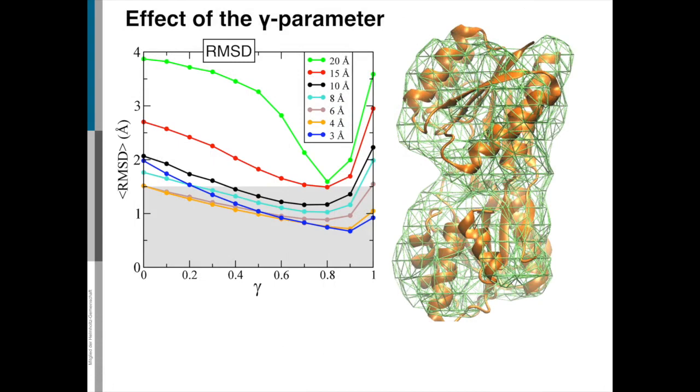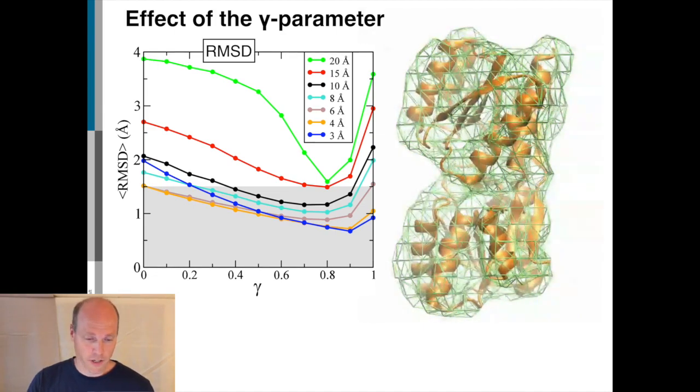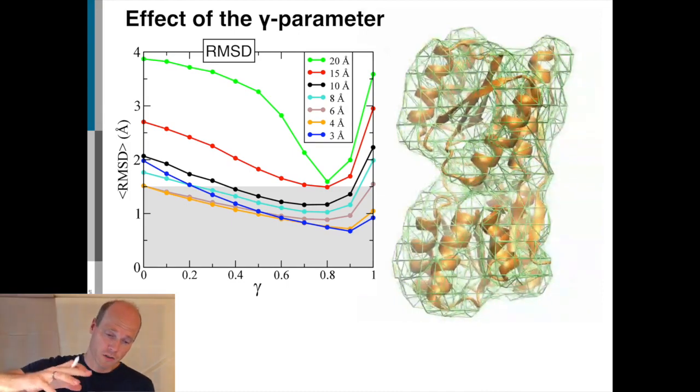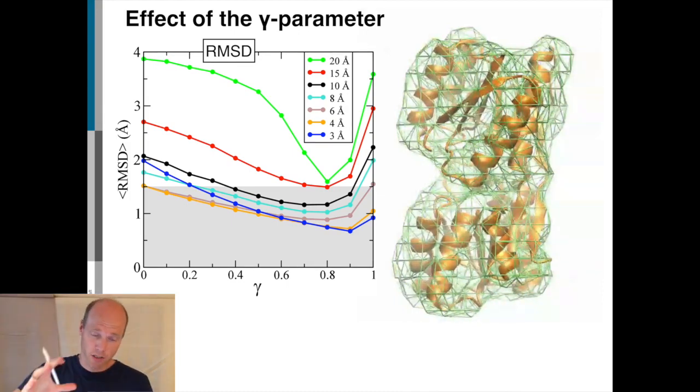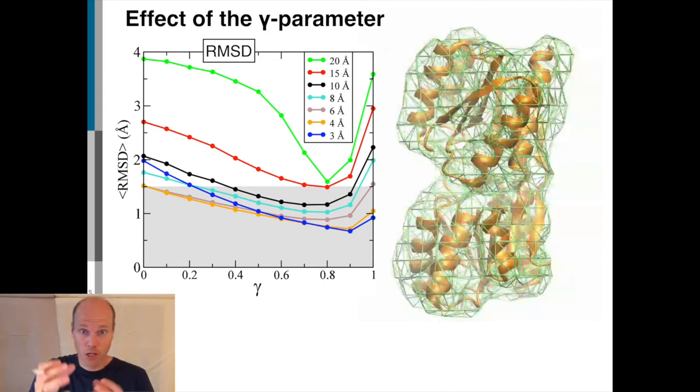So if you do this, we can make the same refinement again, but now with the DN restraints, and you see you allow this large conformational change. This global conformational change is not very large in this case, but it's a kind of collective global conformational change, while you keep all the internal distances intact, so the secondary structure is basically pretty much in place. But you don't have to choose yourself where secondary structure is. This is taken care of by the network, the deformable network.